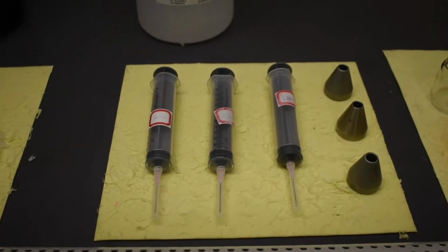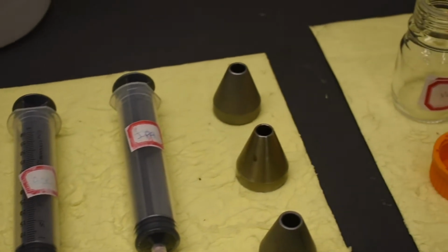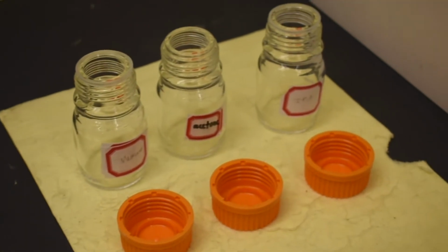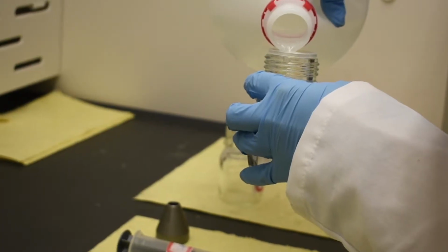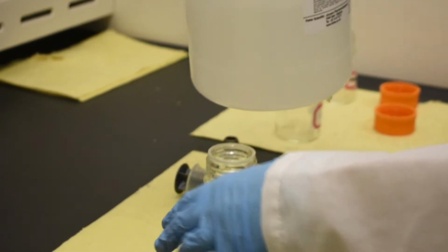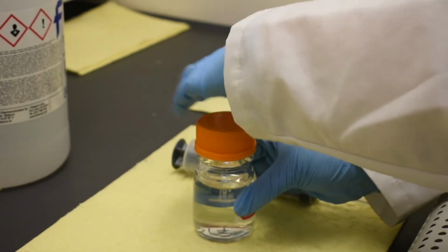Before starting this experiment, it is essential to correctly label your materials. Label each syringe and container adequately to omit the possibility of cross-contamination. Pour the stock solvent into a smaller container. Remember, with the chemicals that are present in this experiment, it is important to recap both containers because these solvents quickly evaporate.